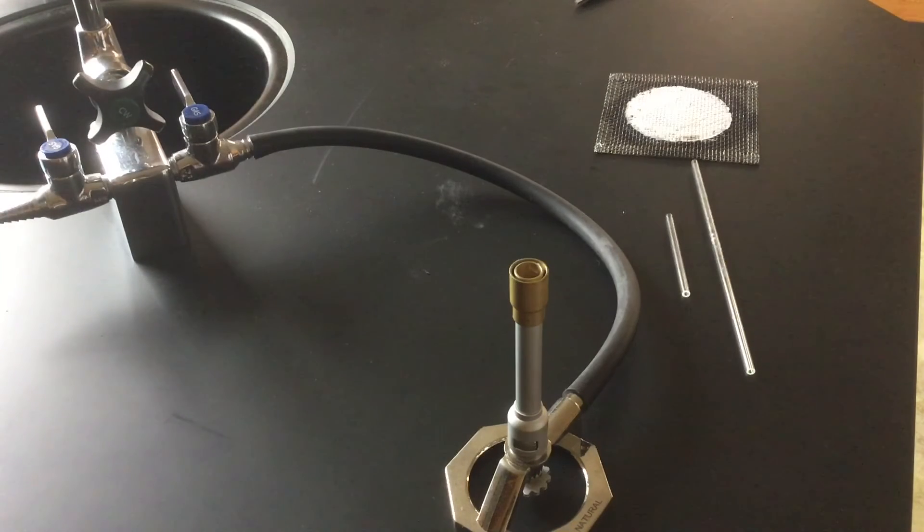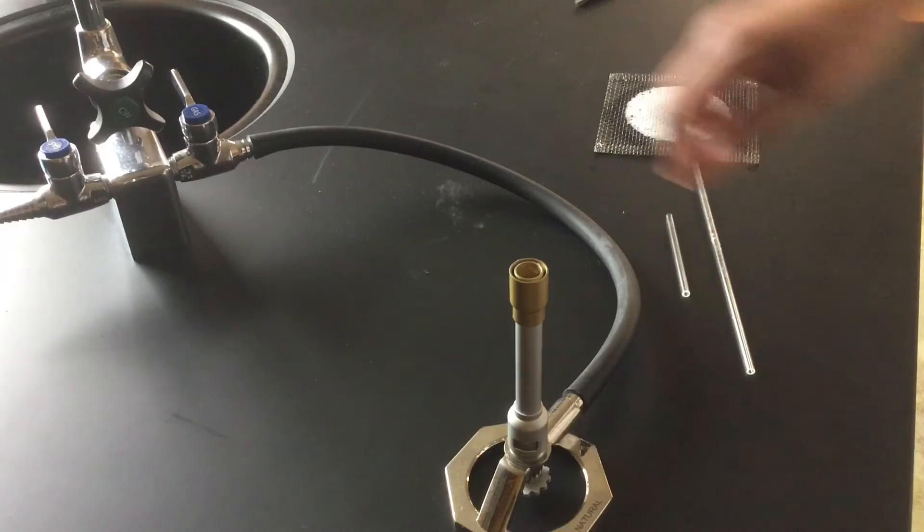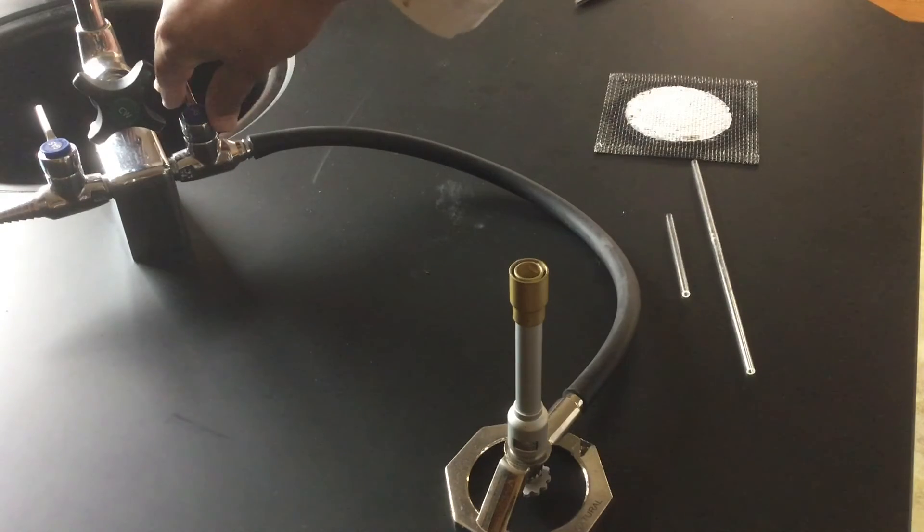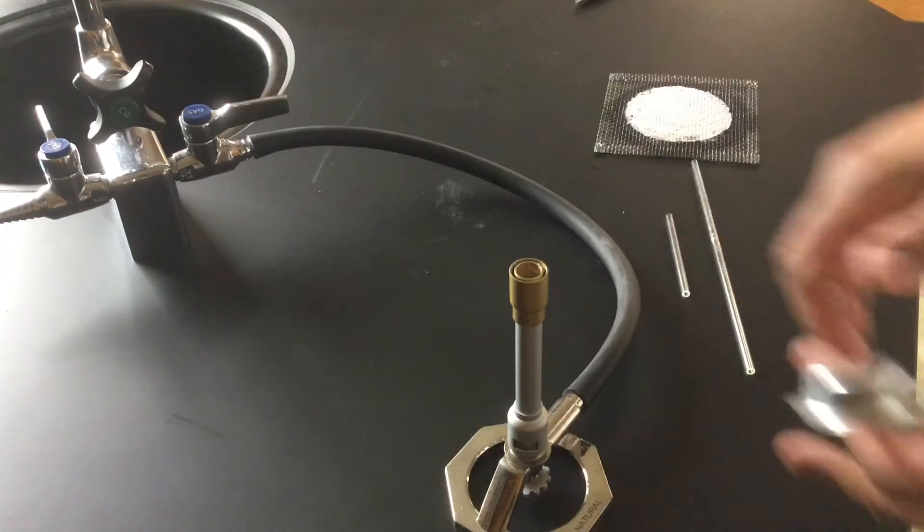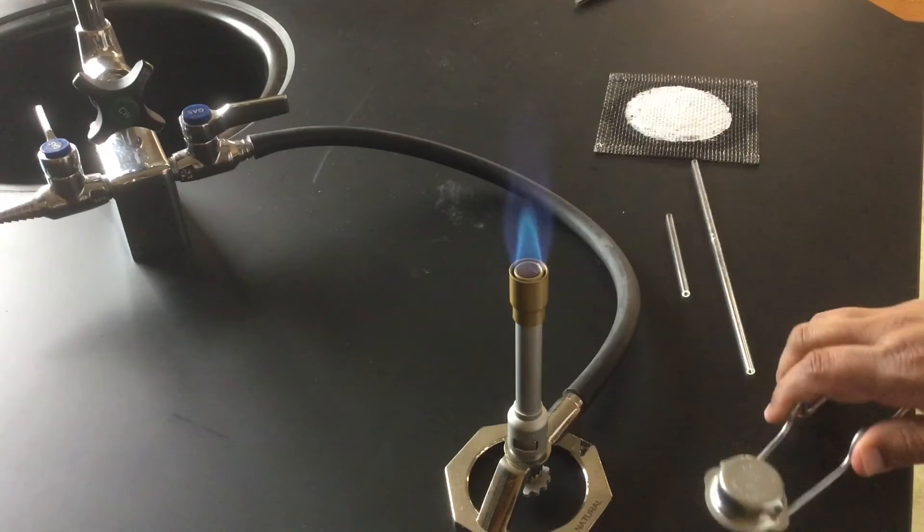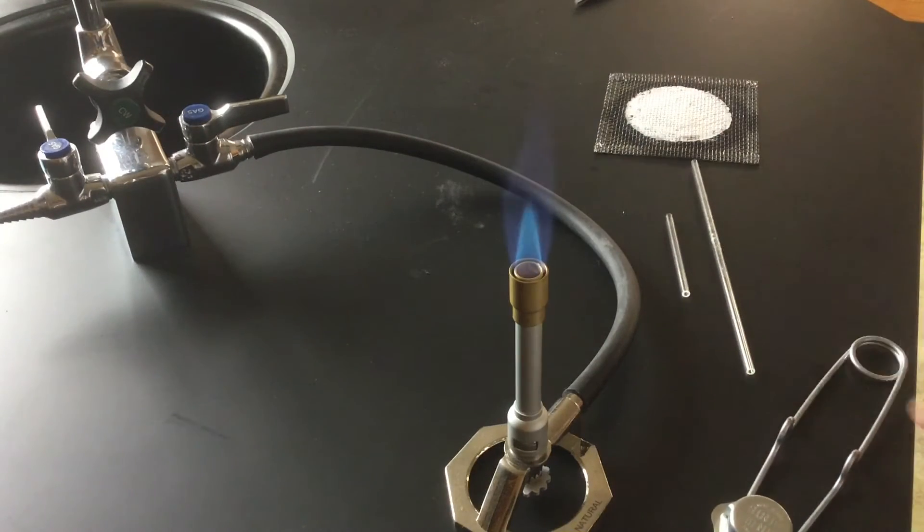So to fire polish the piece of glass I'm going to use my Bunsen burner flame. Just like we've always done I'm going to turn the gas on and light the flame. And in order to do this I need a very hot flame.